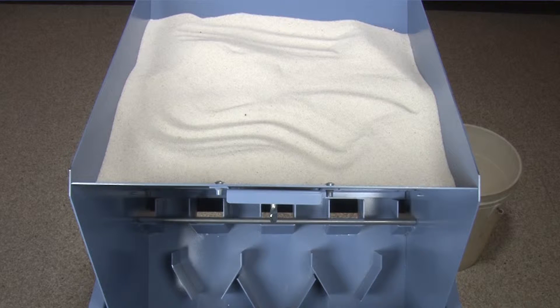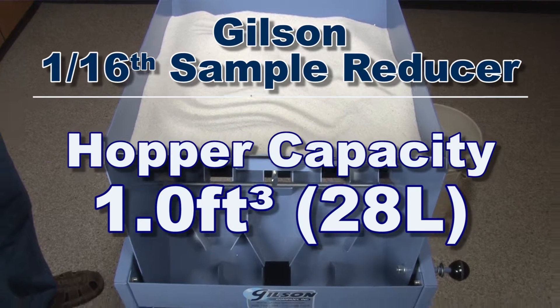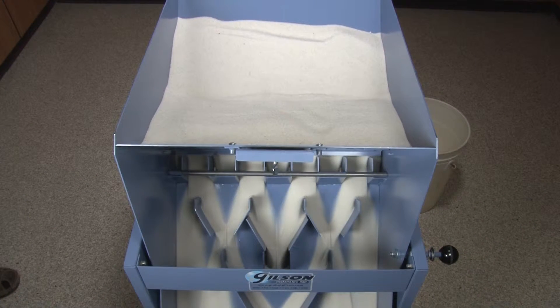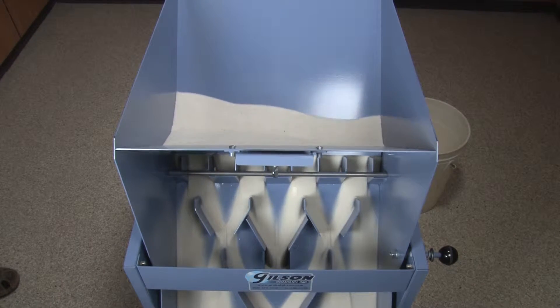Once the bulk sample is evenly loaded into the large 1 cubic foot capacity hopper, simply release the bulk sample through the fully adjustable sliding gate to yield a 1/16th representative specimen in a single pass.